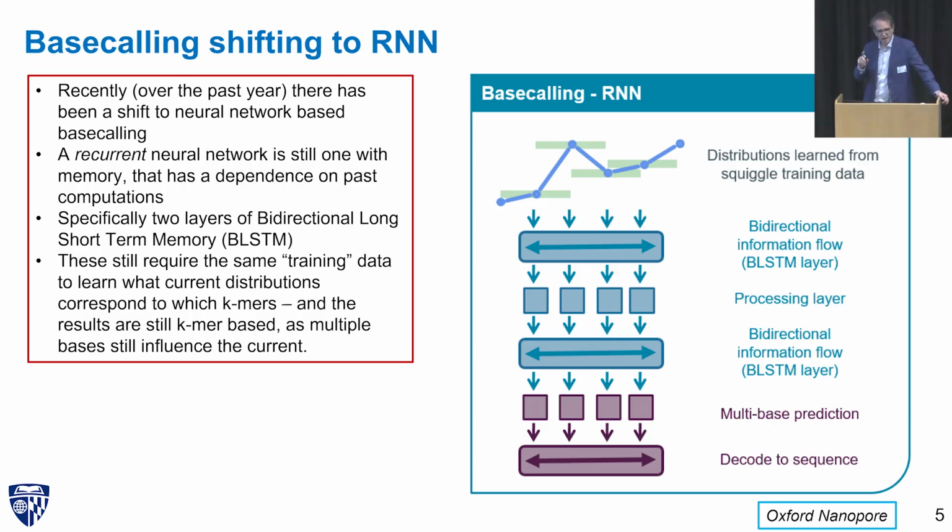But it's also powerful for doing Basecalling. And so by taking that same kind of data and leveraging that same information, that as the DNA is going through the pore, you get multiple bites at the same apple, you get to see the transit, you can actually get much more accurate Basecalling.